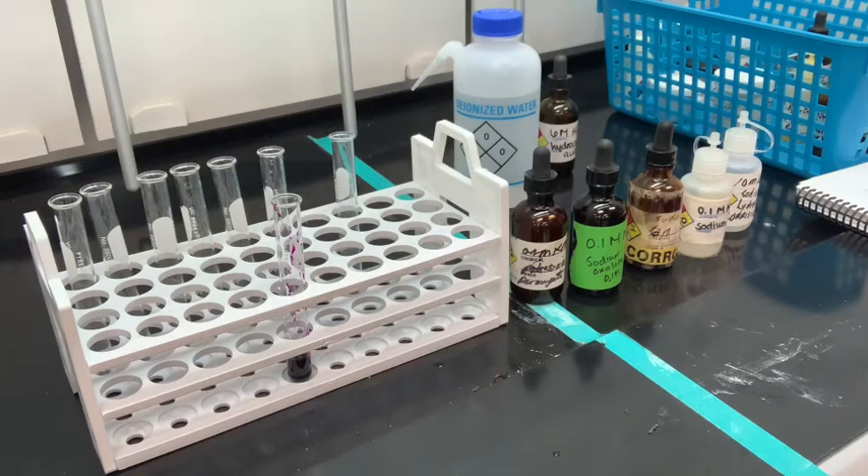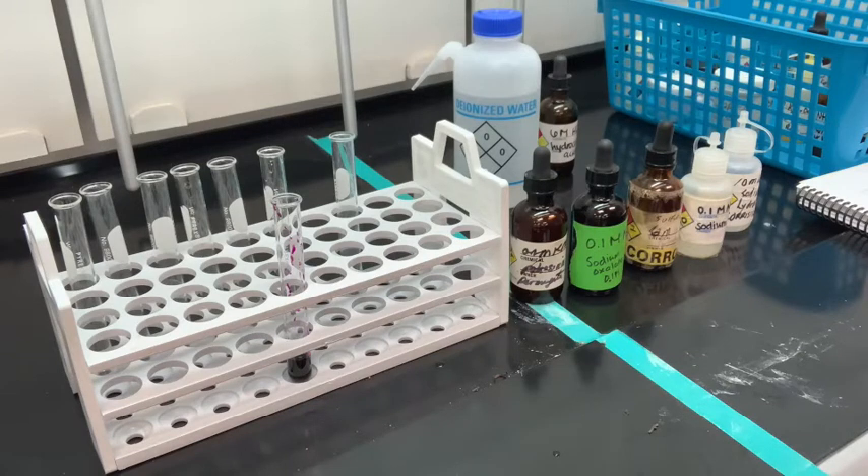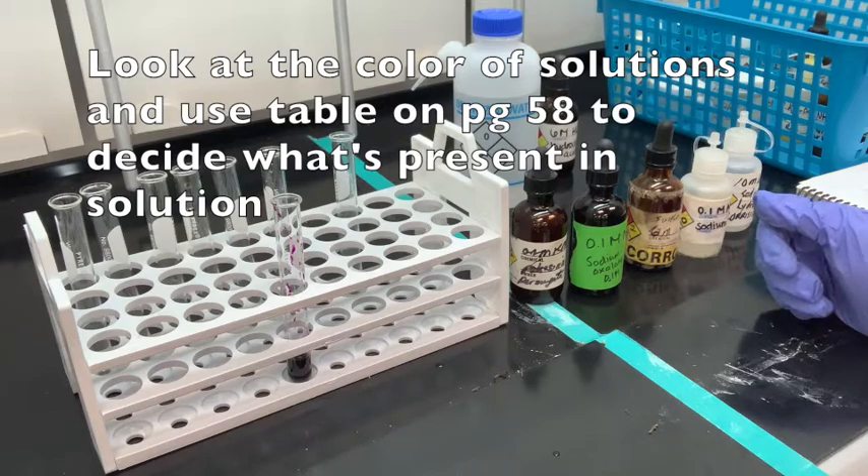We're going to add sodium oxalate and sulfuric acid, and then add the potassium permanganate to see if the permanganate is reduced to the manganese 2-plus ion. To help us decide whether things are reduced or oxidized, we're going to look at the colors that we see and we can also use the table on page 58.